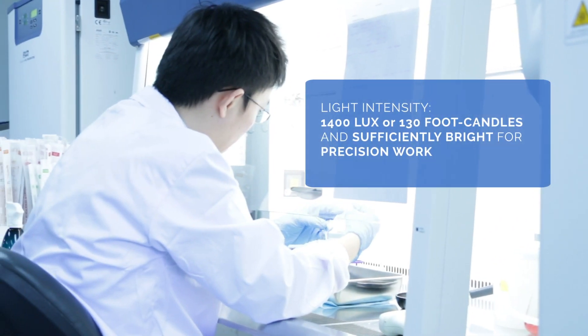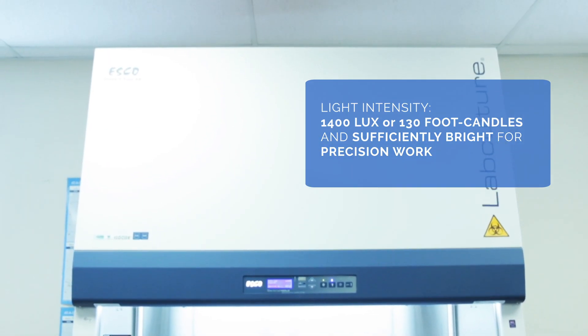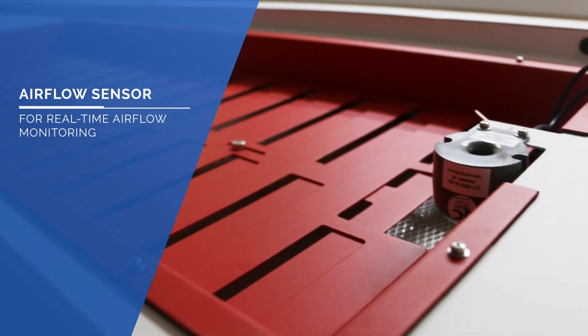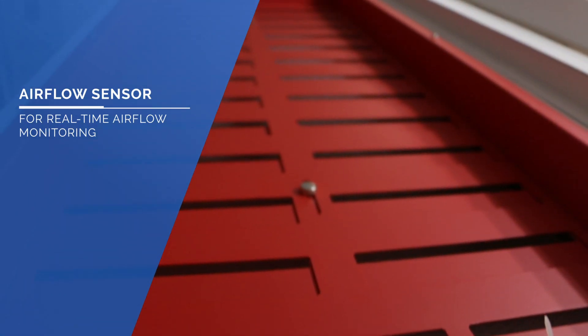There's more! Esco Biosafety Cabinet has a low noise level of 63 dBA and light intensity of greater than 1400 lux within the working area. It is also equipped with the airflow sensor in a donut housing design that monitors real-time airflow.